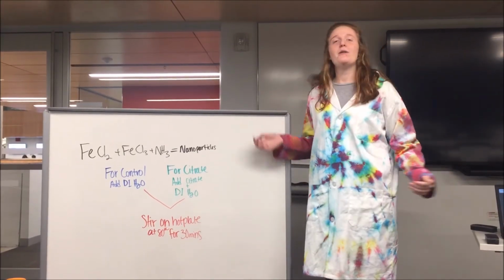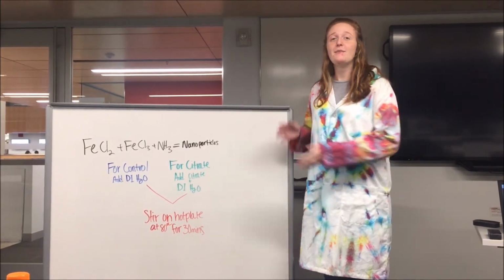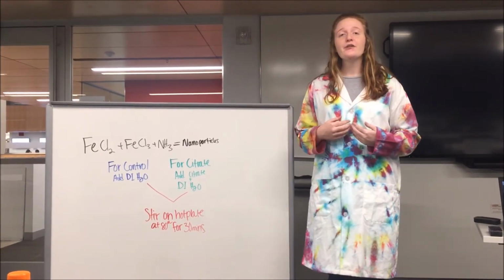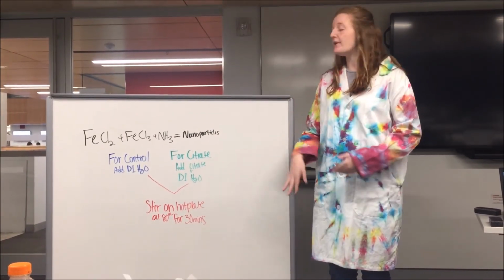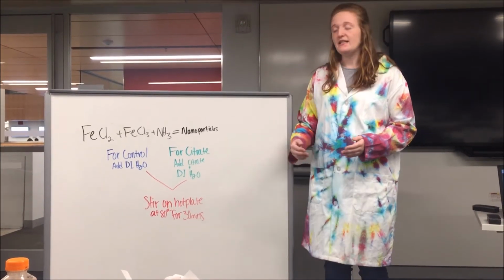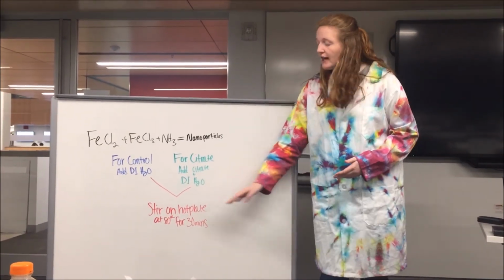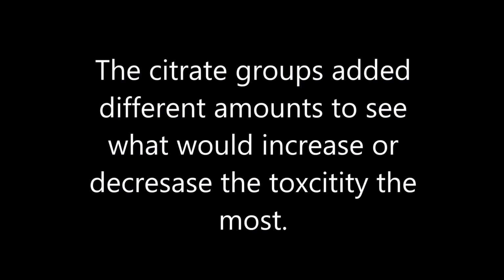On day 1, we mixed iron chloride 2 and iron chloride 3 with ammonia to make the nanoparticles. For our group, we made the control, so we just added the designated amount of water. But the citrate groups added the citrate and the amount of water that was given to them. Both of us stirred on a hot plate for 30 minutes at 80 degrees Celsius with a stir bar.